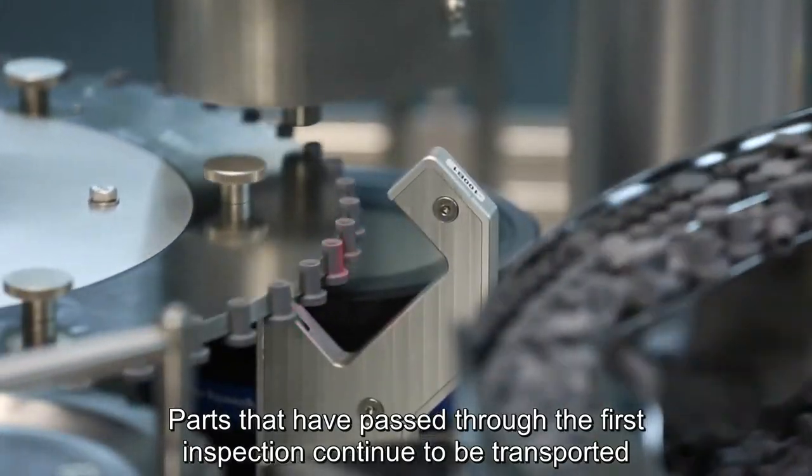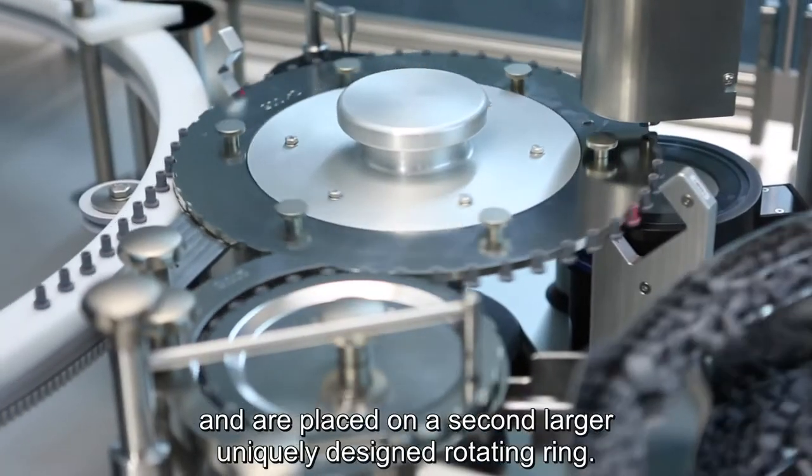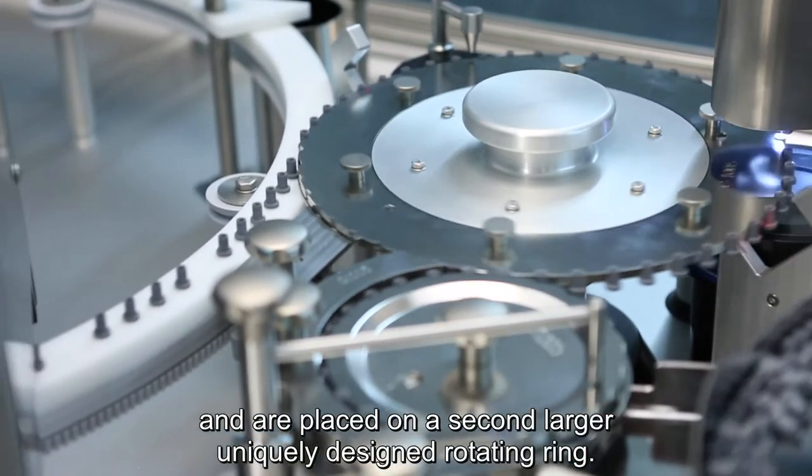Parts that have passed through the first inspection station continue to be transported and are placed on a second, larger, uniquely designed rotating ring.